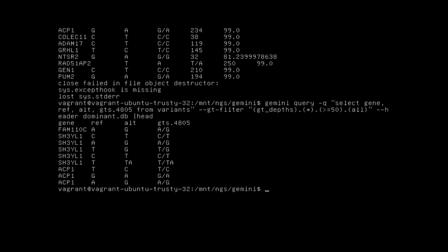This tool is useful for identifying variants that meet an autosomal dominant inheritance pattern. The reported variants will be restricted to those variants having the potential to impact the function of affected protein coding transcripts. Our PED file indicates that within our trio, both the mother and son are affected. And since we have only one of the parents to be affected, the tool will report variants where both the affected child and the affected parent are heterozygous. We'll query and limit the attributes returned by using the --columns option. Let's clear the screen before we begin this query.